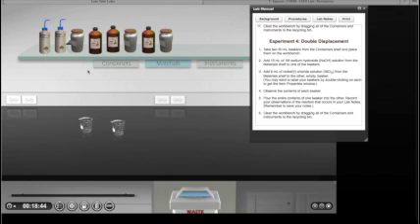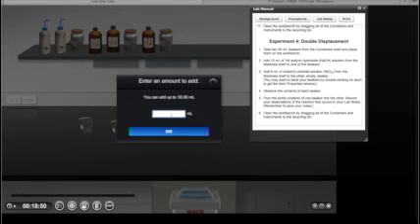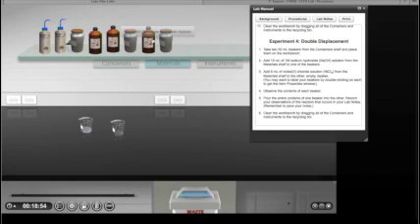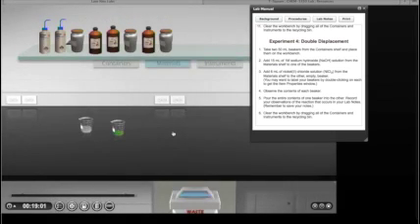Then we go to the materials section where you find chemicals and compounds like water, magnesium, zinc, or sodium hydroxide, as we're using in this experiment, which you can use in your experiments. And right now we're adding 15 milliliters of sodium hydroxide to one beaker and 6 milliliters of nickel chloride to the other. Now we're going to observe the beakers.